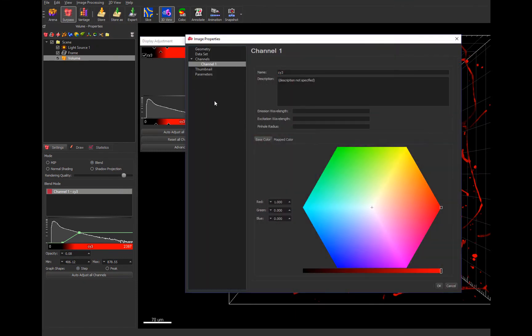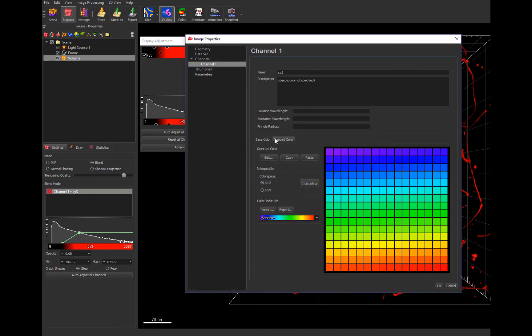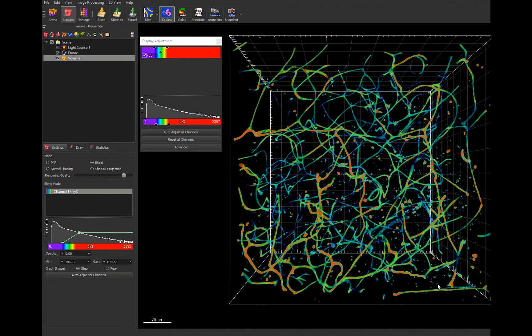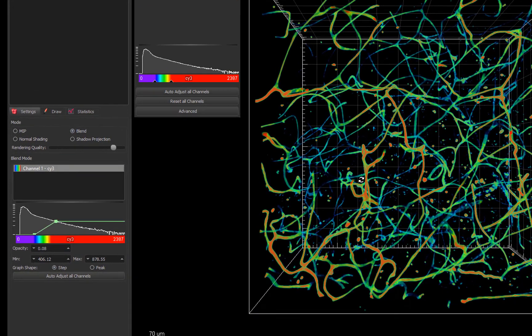As in the slides, you can apply a lookup table to the channel. Here you can better see how the higher-intensity voxels, in red, are visualized.